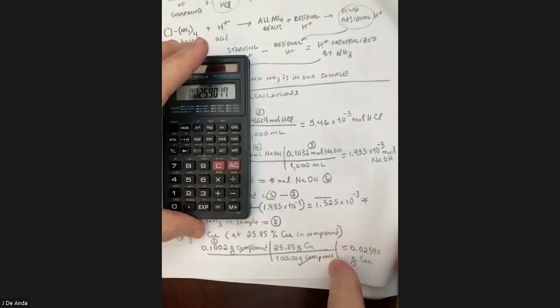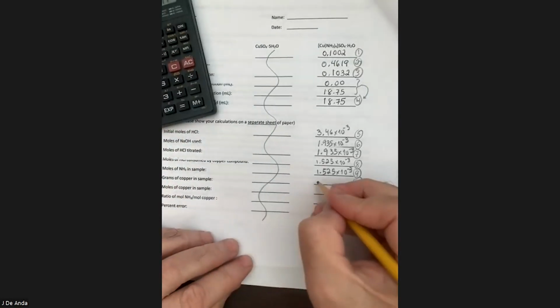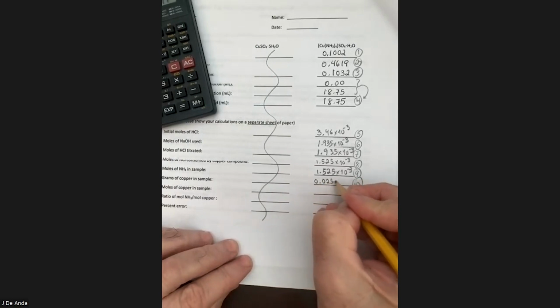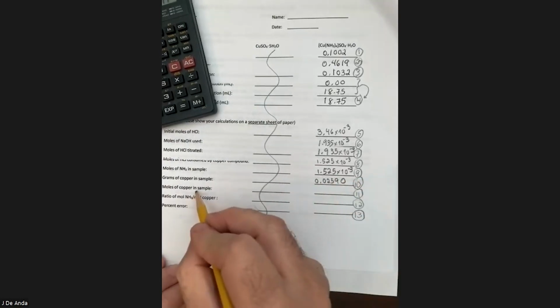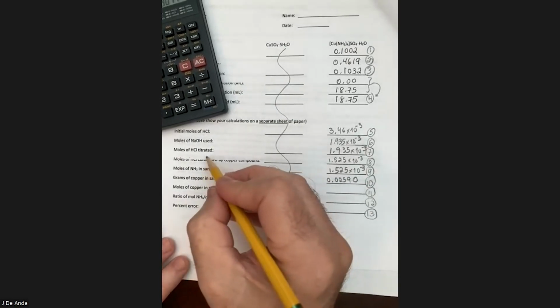So let me go ahead and copy that over, 0.02590. And now we're going to find out how many moles of copper we had in the sample. Actually, I could have bundled some of these steps together, but I wanted to split them to make it easier for us to follow along. So we're going to do item number 11, which it says here is the moles of copper.